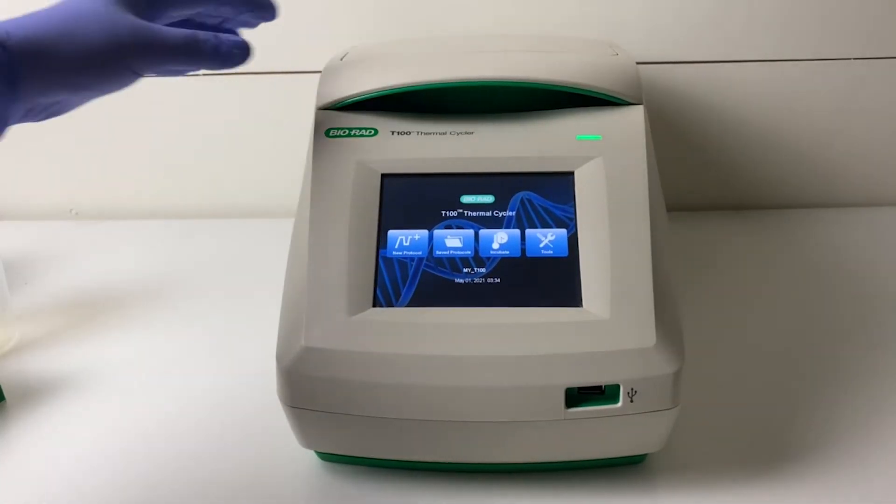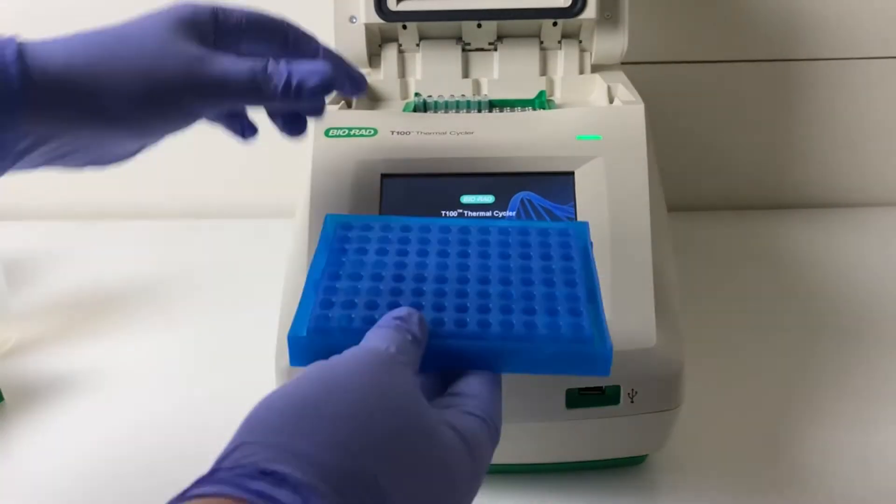Place the tubes in the thermal cycler and run the cycle indicated in the manual. After the program is finished, the samples can be left in the thermal cycler overnight or stored in the fridge.